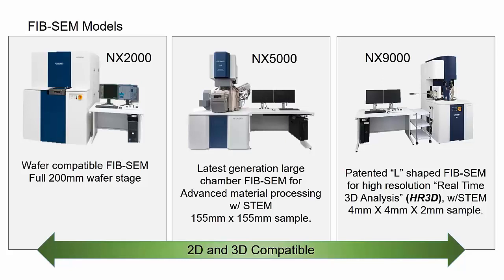It's designed to accommodate different kinds of devices and detectors by having a very tall main chamber, which can be retrofitted or equipped with a cold stage, cryo stage, air protection, as well as EDS, EBSD, a lift-out system, multiple gas injections, and as a 2-column or a 3-column type of FIB-SEM. In fact, all 3 of them can be either a 2-column or a 3-column type of FIB-SEM.